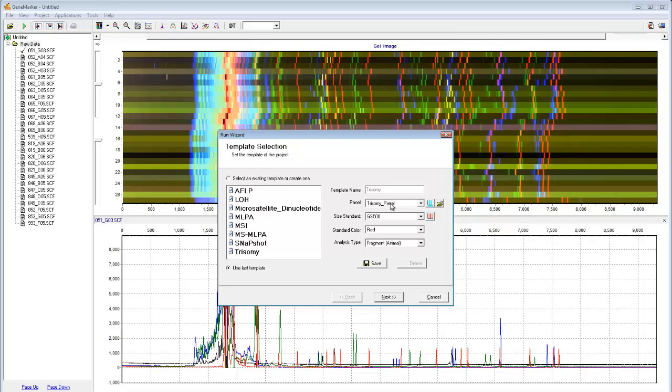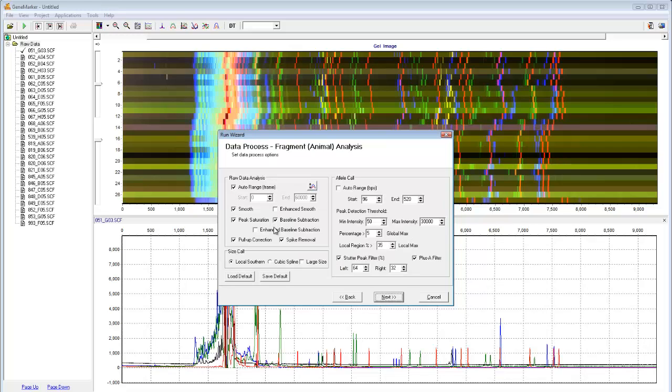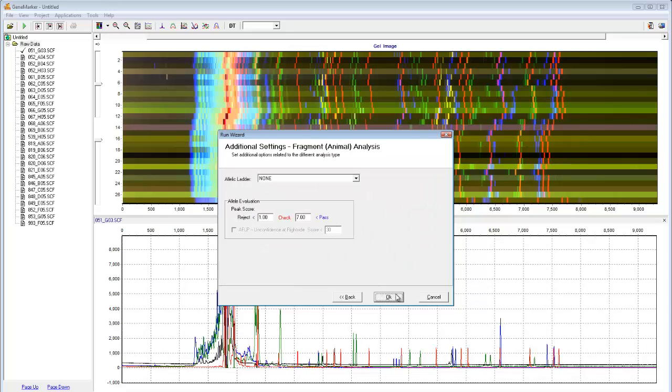Select the panel, Size Standard, Standard Color, and Analysis Type, or simply click on the corresponding pre-saved template. Then click Next. The settings in this and the following window can be modified for more specialized projects. However, the default settings, which can be obtained by clicking Load Default, are in accordance with the best practice guidelines, making them appropriate for nearly all typical analyses. If using the defaults, simply click Next and OK.